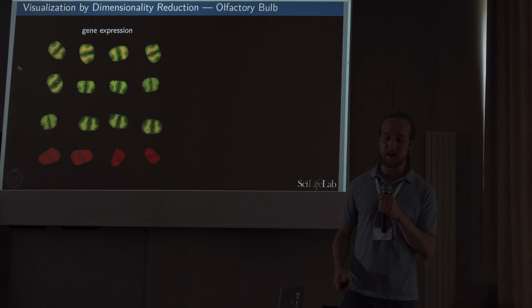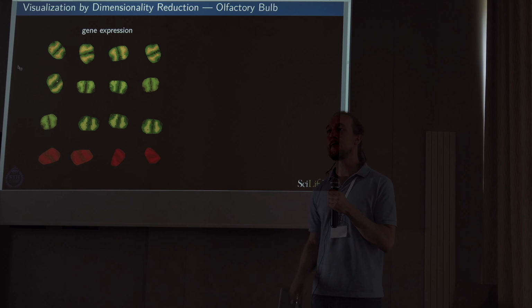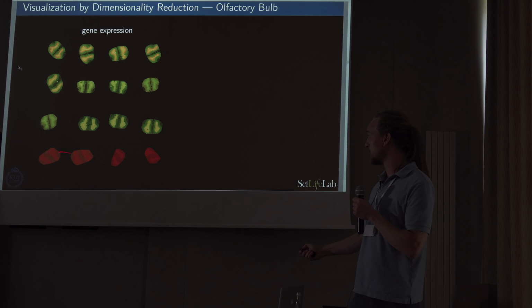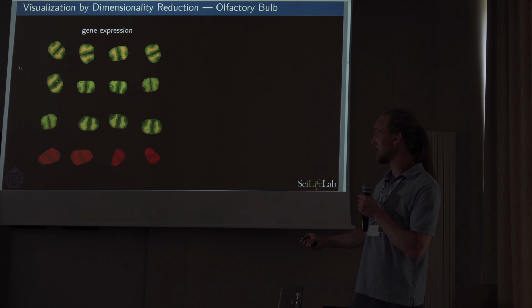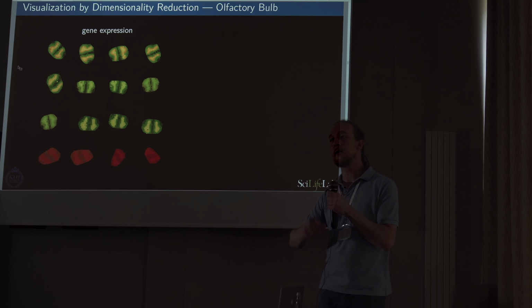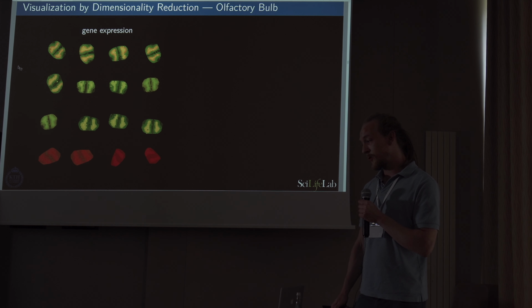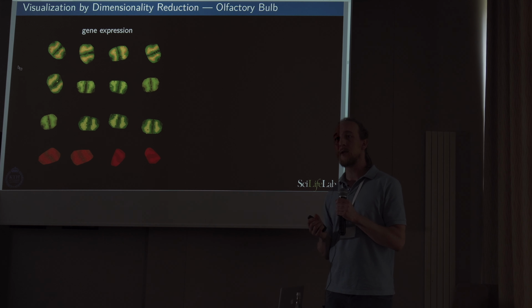So you might be thinking, well, that's the different day of experimentation. However, if you leave those experiments out here, the last 4, then you get batch effects visible between some of the other samples versus the others. This is in line with the TSNE highlighting the main points of variation and somewhat neglecting the others. With this, I also would like to highlight that one should conceive of TSNE really as a visualization technique as opposed to an analysis technique.